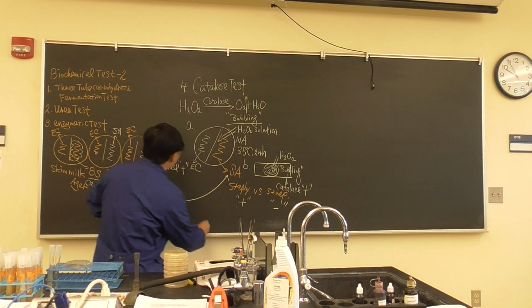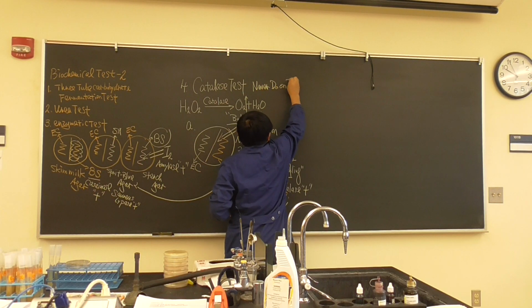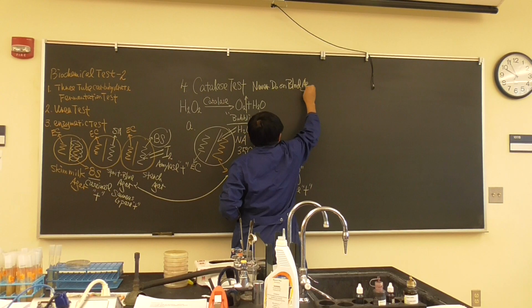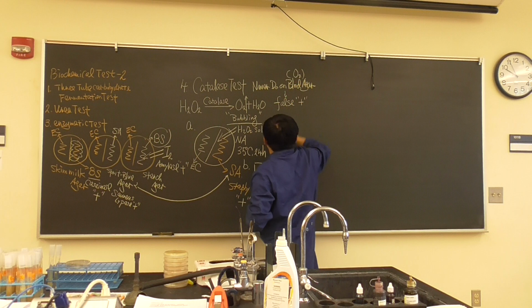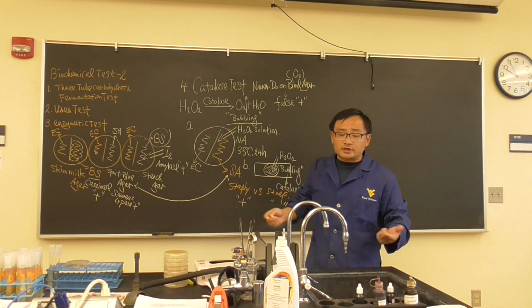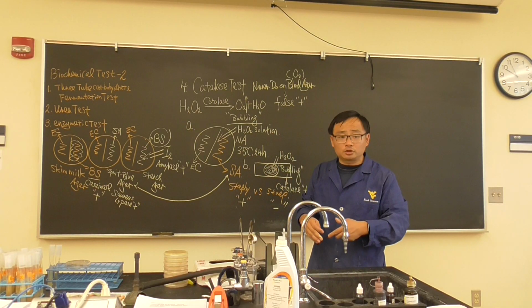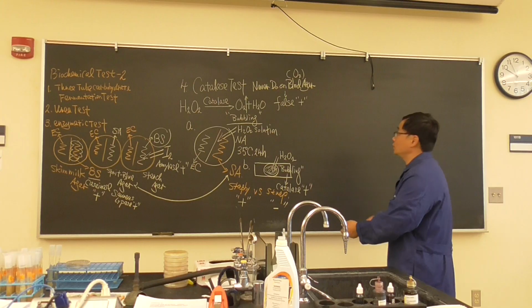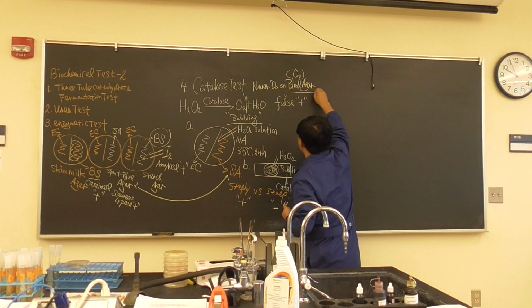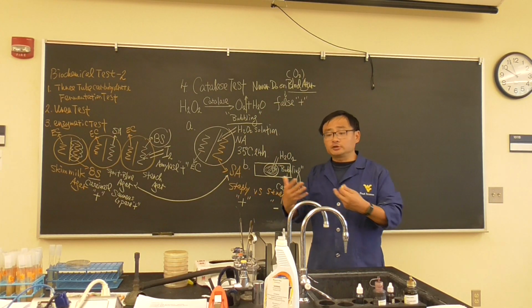So you have to always remember, catalase test, never do on blood agar. This will give you false positive. Because blood agar already has oxygen there. Sometimes will be correct, sometimes will be wrong, because when you grow, the oxygen is used, but when you add H2O2, it's gonna start the bubbling, no matter what. So never do it on blood agar. It's important. But lots of people don't know, because blood agar is a good clinical isolation agar. They try to do multiple tasks at the same time.